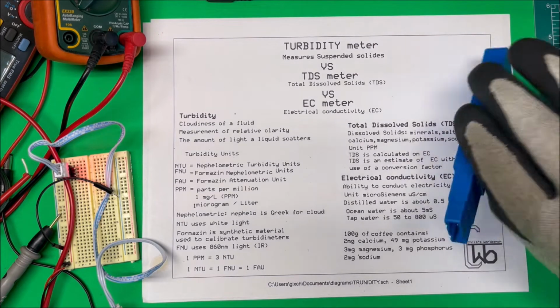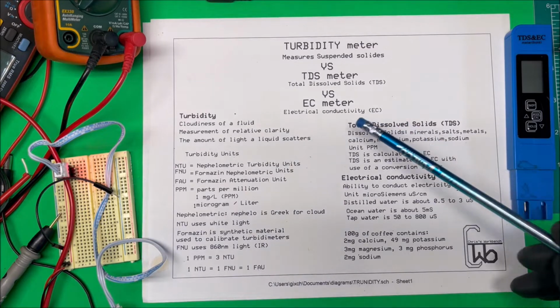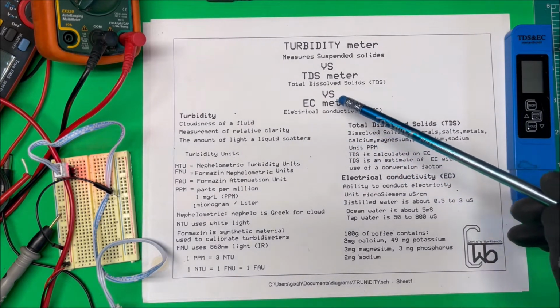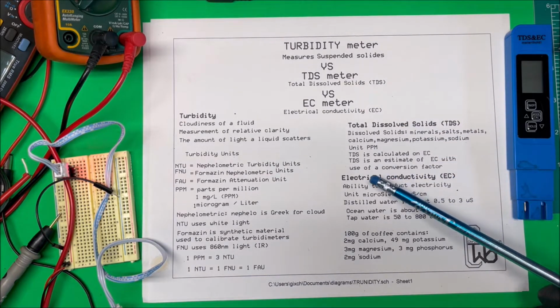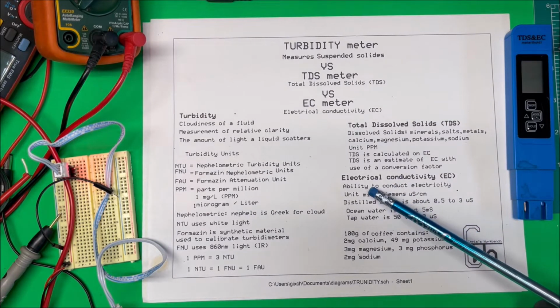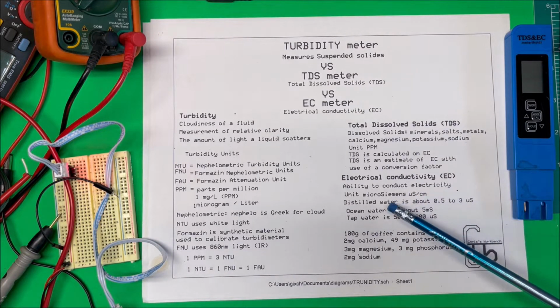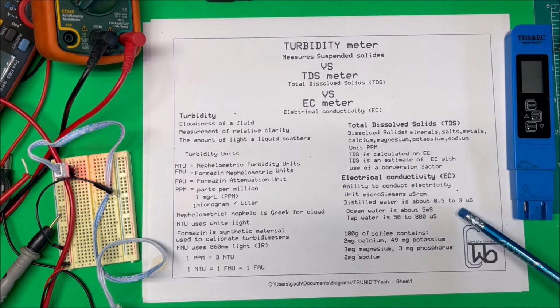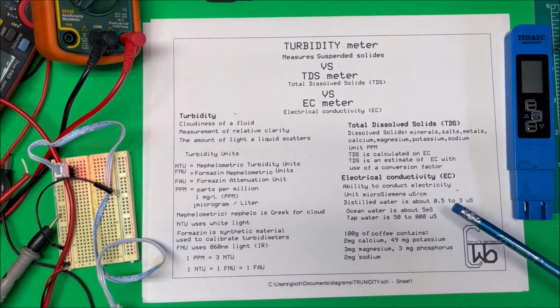Electrical conductivity, there's just two little probes in here that go into the fluid and test electrical conductivity. And from the EC meter, you calculate the TDS, the parts per million. Okay, and it's an estimate of the EC, they use a conversion factor. But the electrical conductivity is the ability to conduct electricity, and they measure that in microsiemens. So distilled water is about 0.5 to 3 microsiemens, and salt water is about 5 millisiemens.